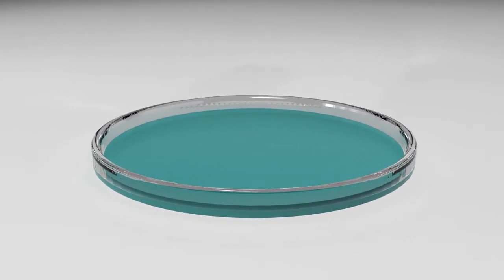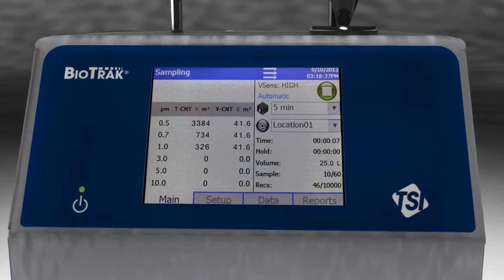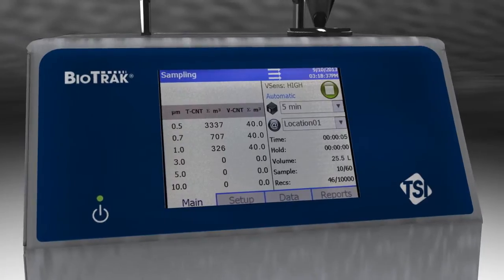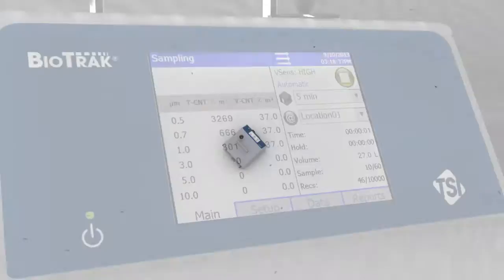Viable particle counts are updated on the instrument display in real-time. The Biotrek particle counter can be used as a portable instrument or integrated seamlessly into a facility monitoring system.